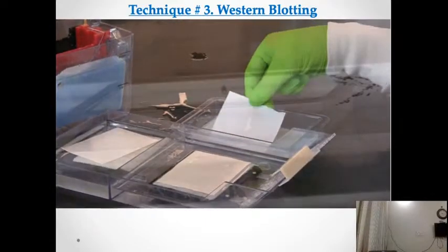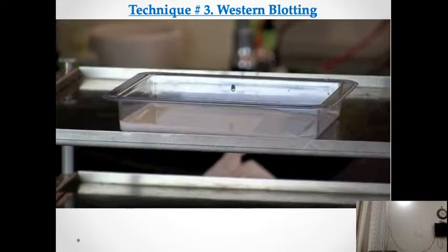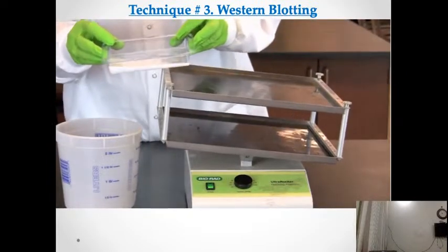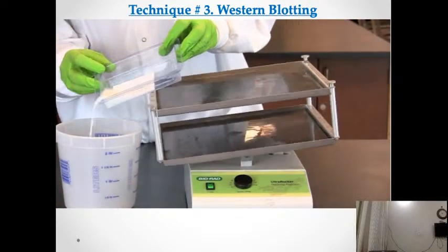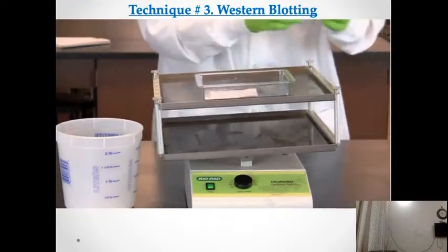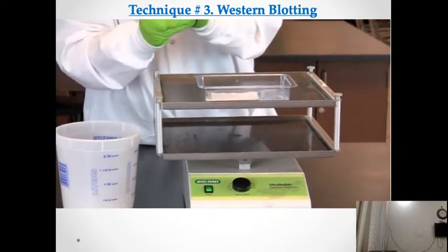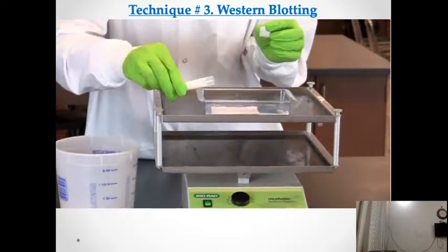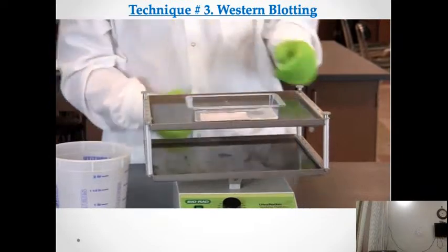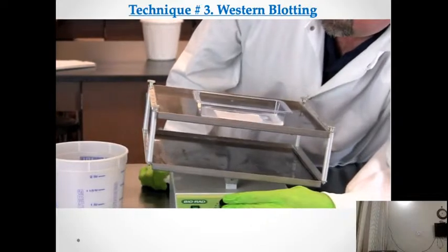Immerse the membrane in 25 milliliters of blocking solution and incubate it for 15 minutes at room temperature on a rocking platform. Pour off the blocking solution. Add 10 milliliters of primary antibody. Incubate for 10 to 20 minutes on a rocking platform. The platform should be set at a faster setting to ensure constant coverage of the membrane.